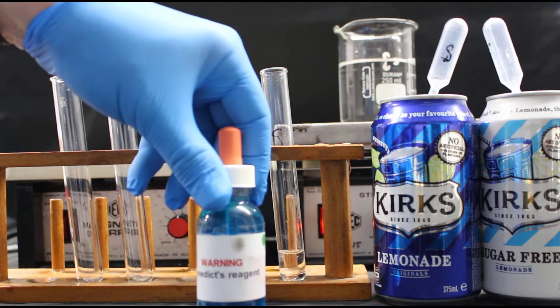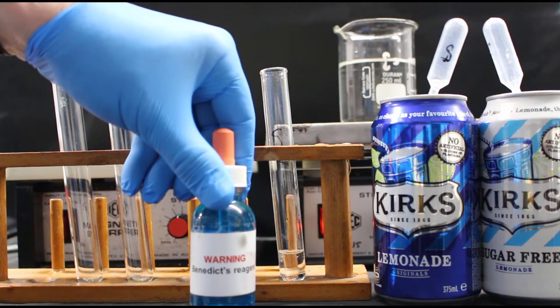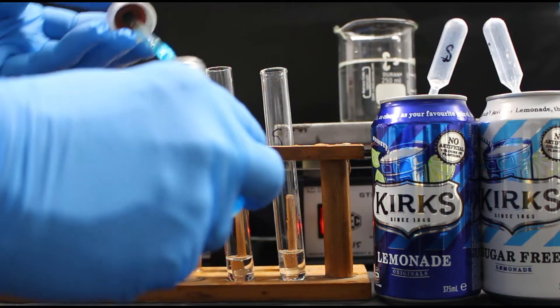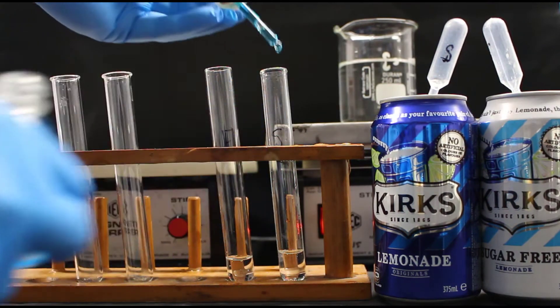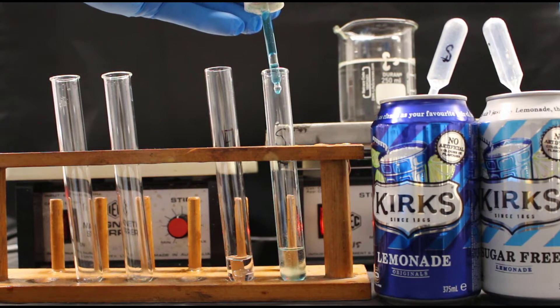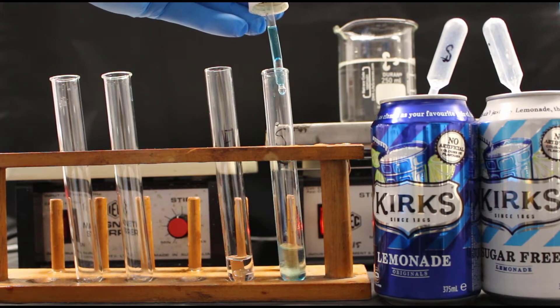Next, I place 20 drops of Benedict's Solution into each of the test tubes. Benedict's Solution is a solution that contains copper and in the presence of glucose it changes into a bright orange or red brick color.